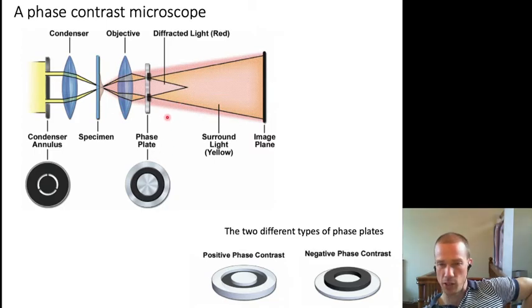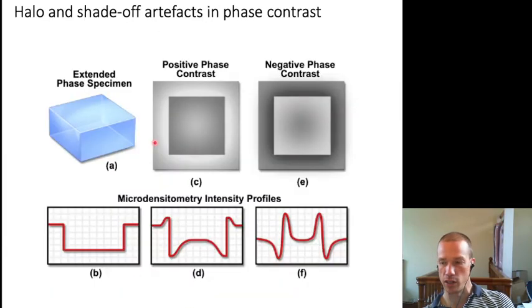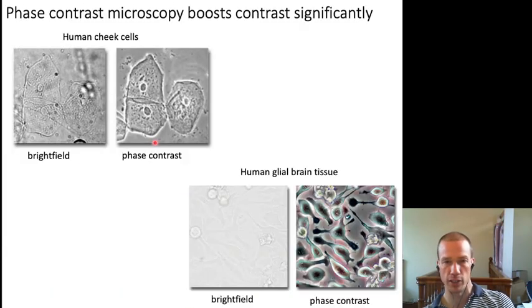And if you use a phase contrast objective, it has this phase plate in it, which has this darkened ring in the middle, which can reduce the intensity of light which passes through that ring by 70 to 90%. Not all the light passes through this region, but the bit that does gets damped down quite a bit. And this can reduce the amount of fluorescent signal you get through your system, so it's obviously not as good as a bright field objective for fluorescent imaging. You can't remove the phase plate from a phase contrast objective. It's basically built into it. And that can be an important consideration when you're trying to consider what kind of transmitted light image to take along with your fluorescent image.